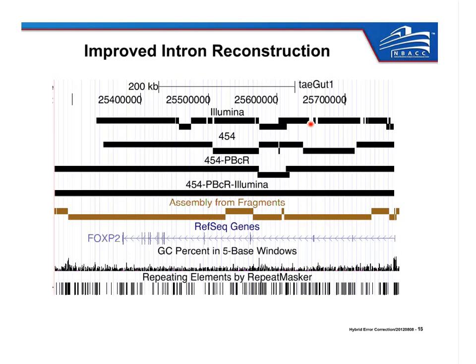The 454 data helps improve over this Illumina assembly and fills in some of these gaps, but it's still relatively fragmented, and it still has issues in some of the high GC regions, the one I went back to. So this vertical line here, you can see that all the assemblies except one have a gap here because of that GC bias. The 2 by far best assemblies are the ones that include PacBio. The first one here is the 454 corrected PacBio, and this one is the Illumina corrected PacBio. So the Illumina corrected PacBio assembles this entire 400,000 base gene into one contig.